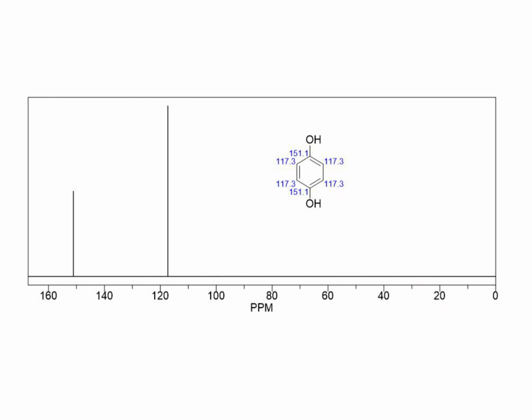Now dihydroxybenzene. You can see the four of them are the same, because just look at that, you can divide this into a plane of symmetry. So these two and this one, only two environments.